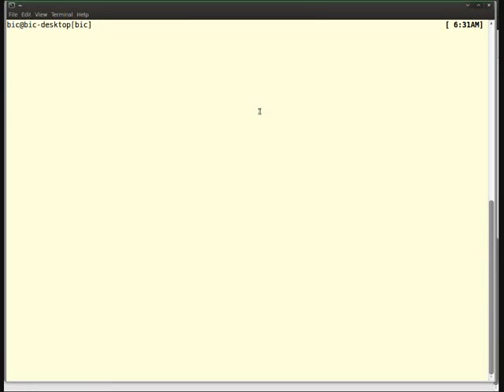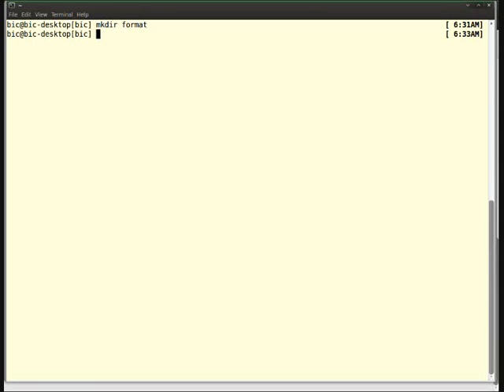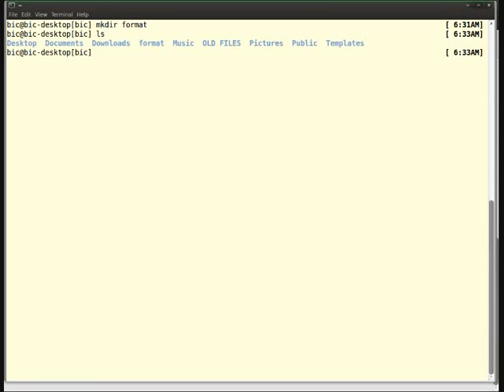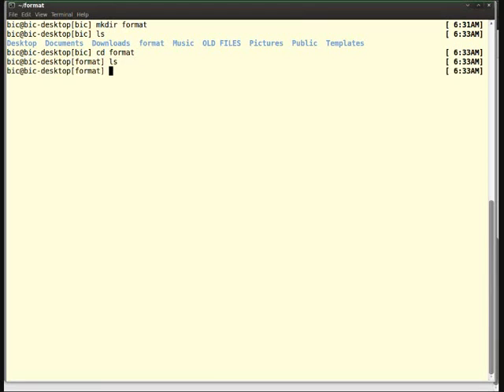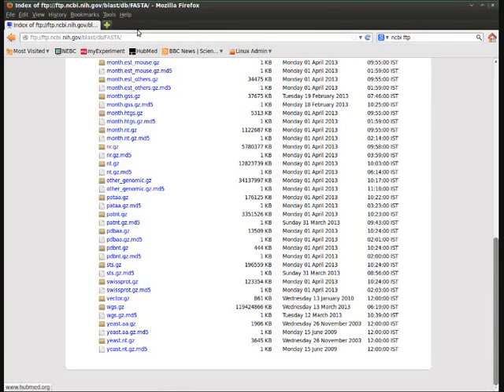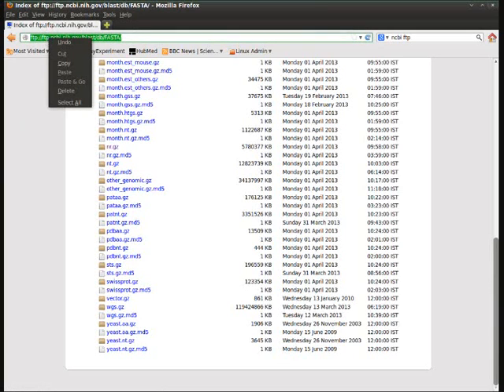The alternate way of downloading the database is to create a working directory in your system. I am just creating a directory with the name formatdb. It is a command. I am creating a directory called format in my working space. In that format directory, I am giving a command called wget and I am going to paste the URL of what we browsed.